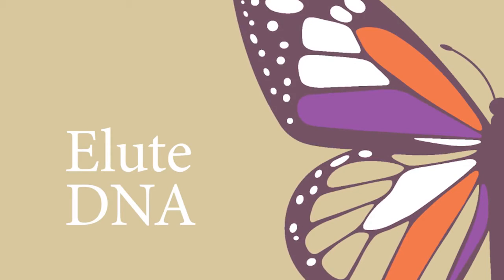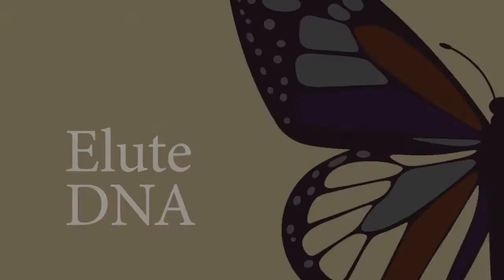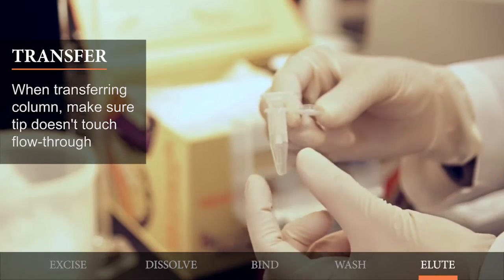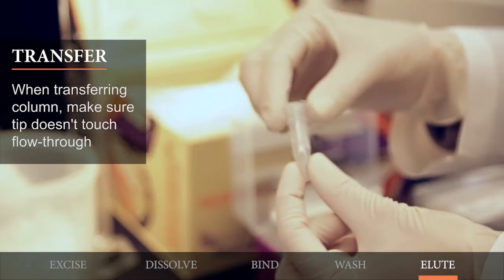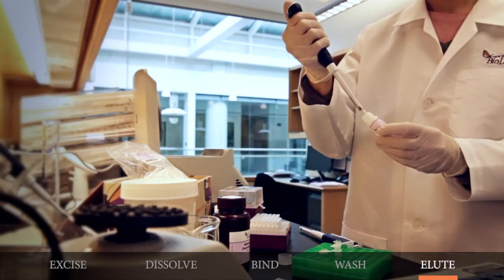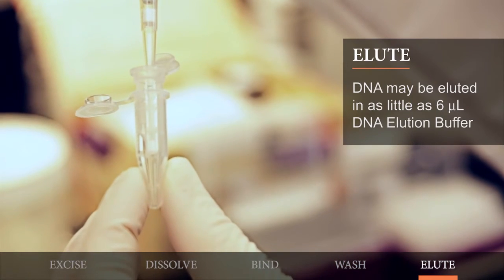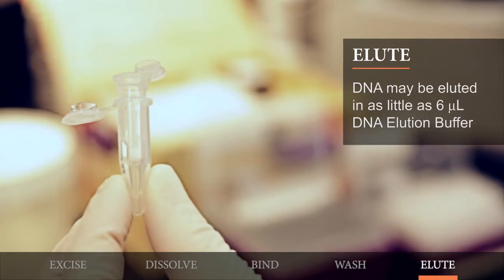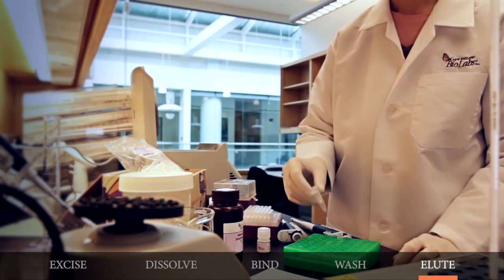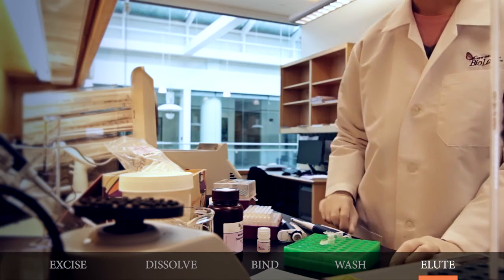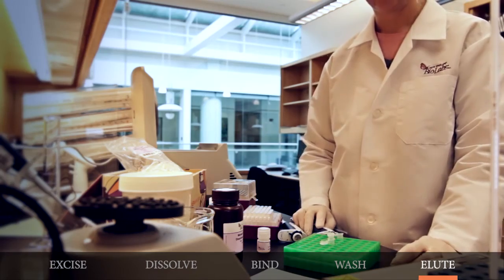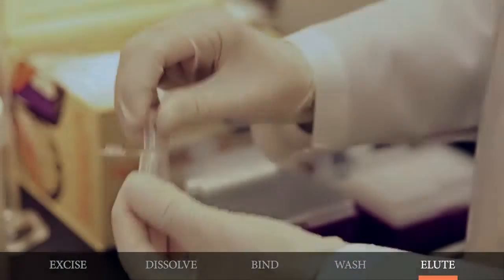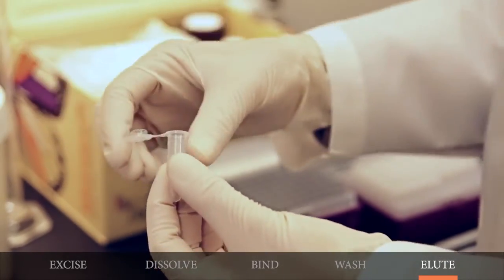In the final step, elute the DNA. Transfer the column to a clean microfuge tube, making sure that the tip of the column does not come into contact with the flow through. Add 6 or more microliters of DNA elution buffer to the center of the column membrane. Incubate for one minute. This incubation step is important for maximizing yields. Centrifuge for one minute and collect the flow through, which contains your gel-extracted DNA.